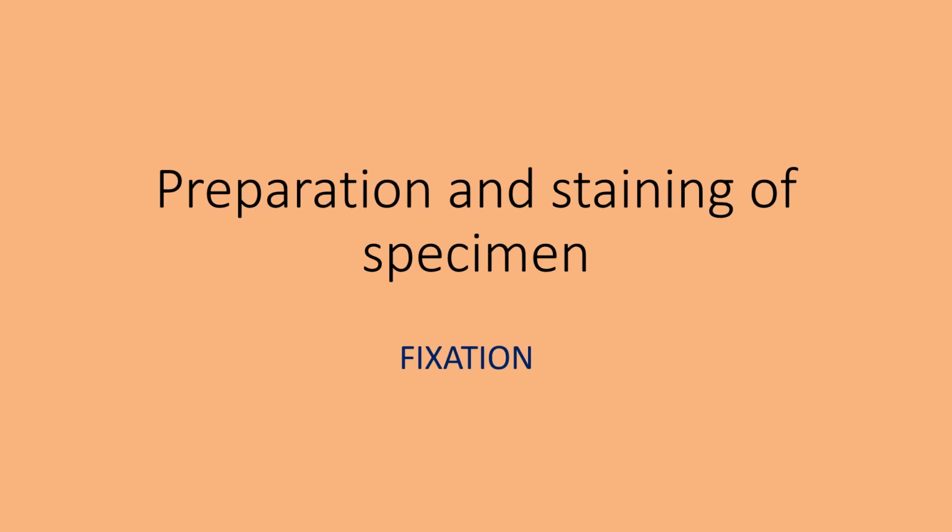Hey everyone, in this video we are going to look at the steps that are required to prepare and stain a specimen for viewing under a microscope. So we'll be discussing fixation.